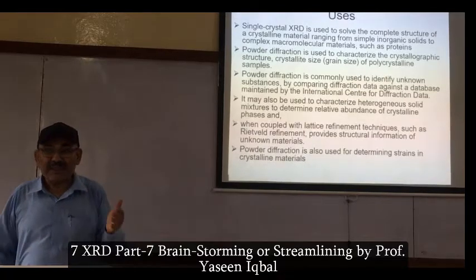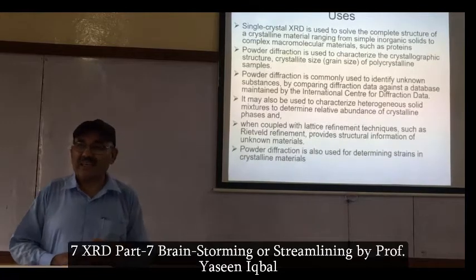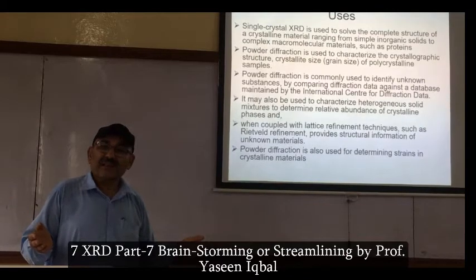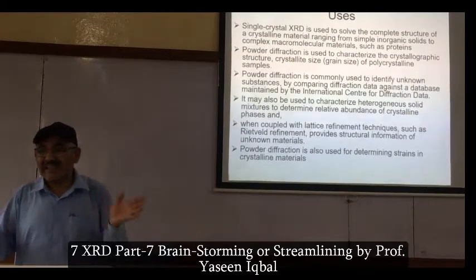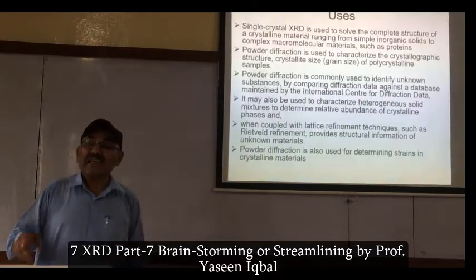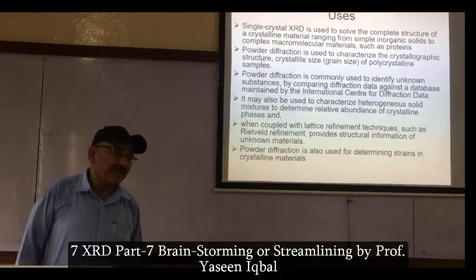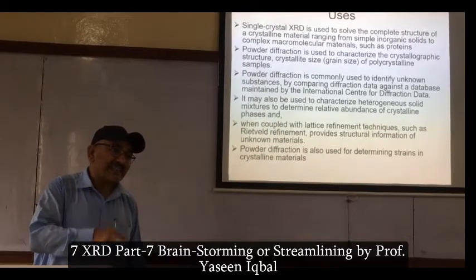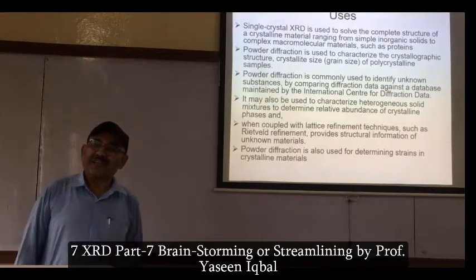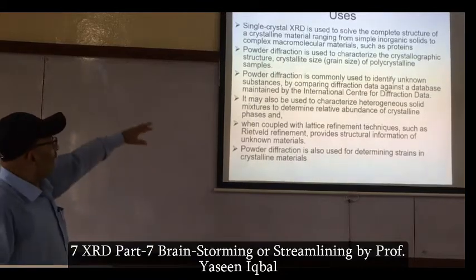So that is why when you say EDS in scanning electron microscopy, and some people call it EDX, right? These names are just to shorten things. It is energy dispersive X-ray spectroscopy. You use electrons to generate X-rays from there, and those X-rays are then identified to know the elemental composition of the material.